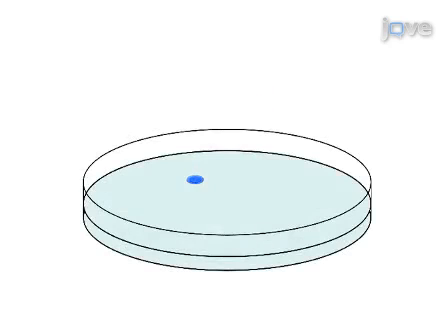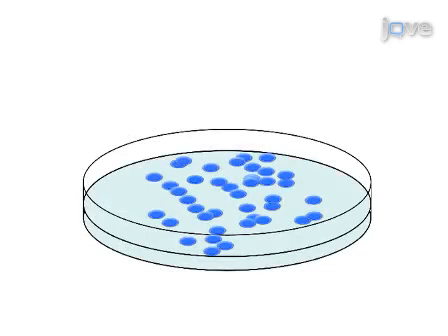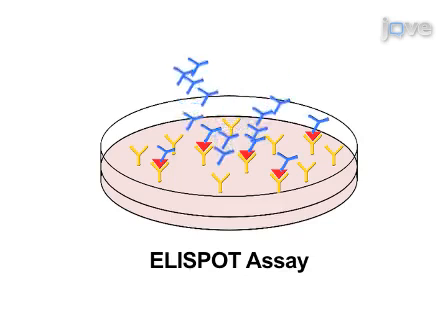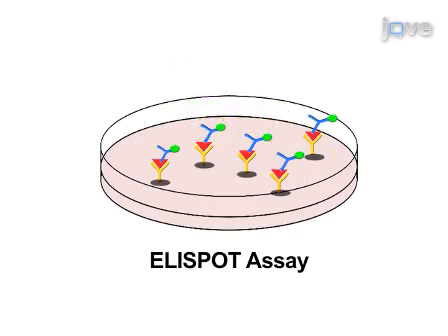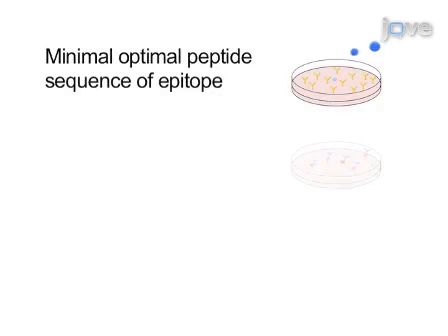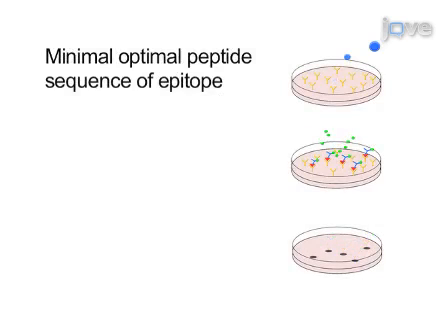After isolating the antigen-specific T-cell clones on the basis of interferon-γ secretion, perform a high-throughput screening interferon-γ ELISpot assay to identify epitope-specific T-cell clones. Continue to characterize the T-cell clones for the minimal, optimal peptide epitope sequences.